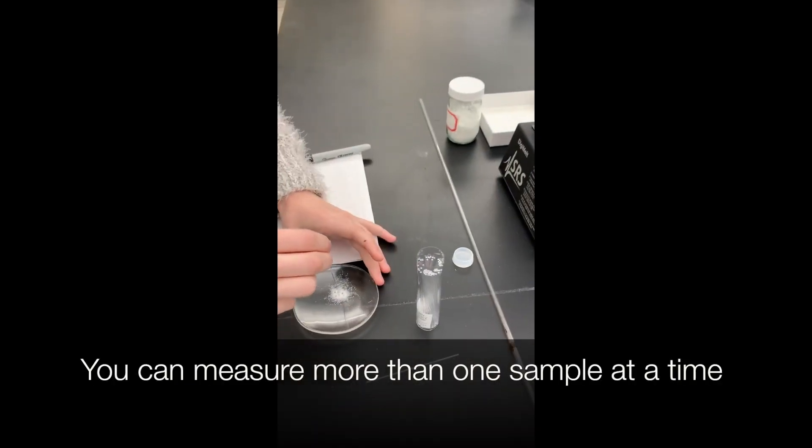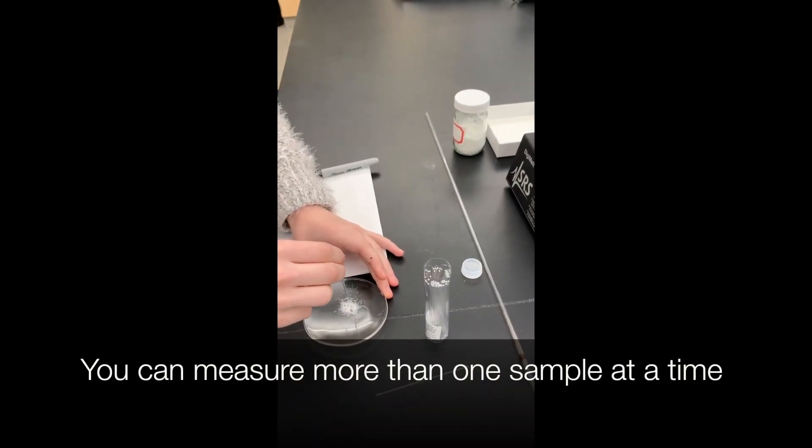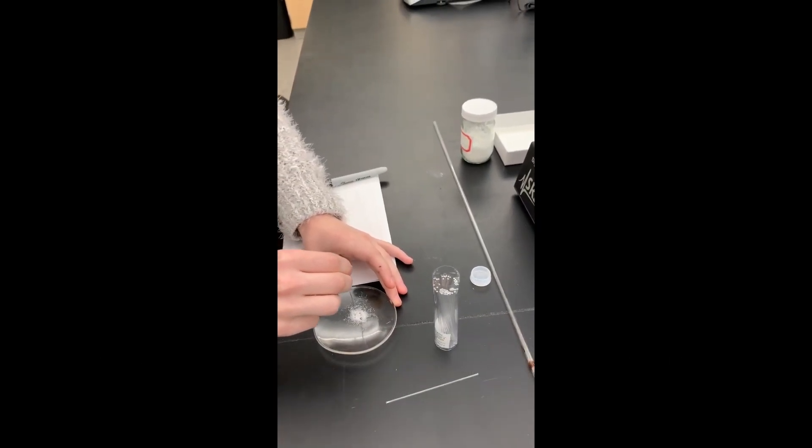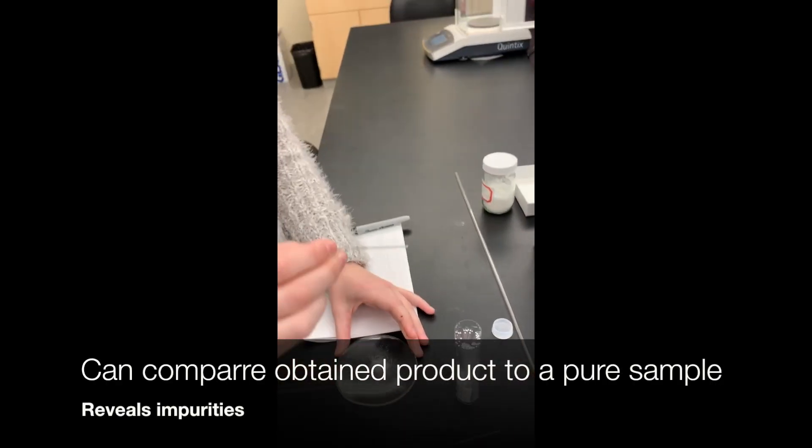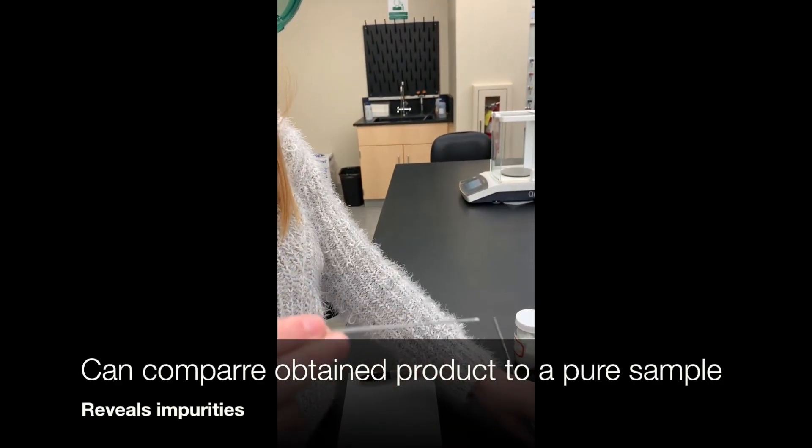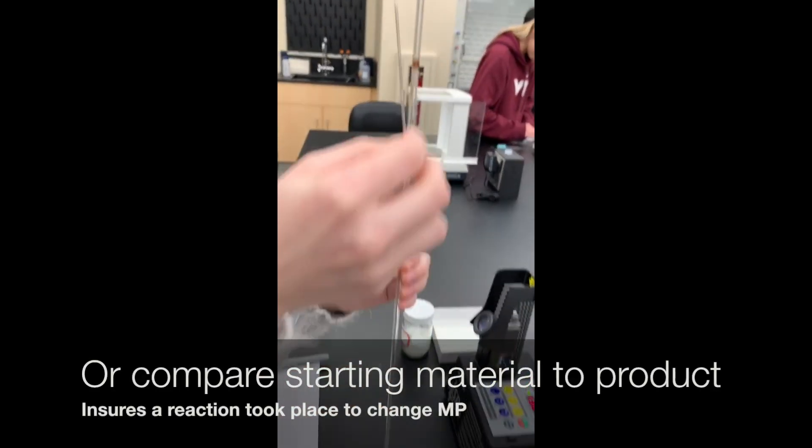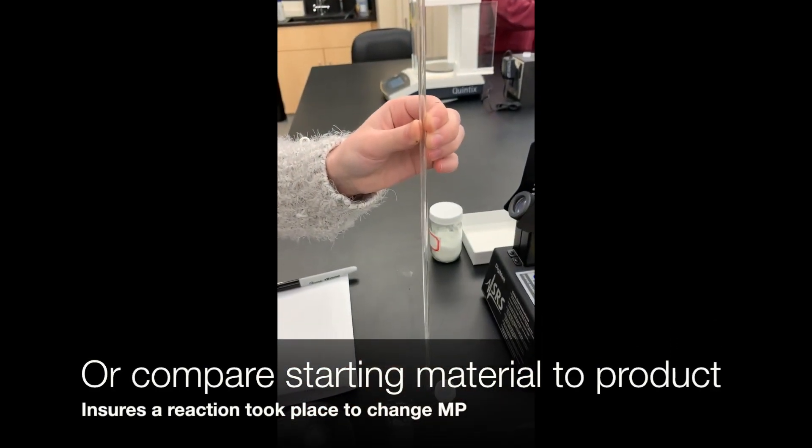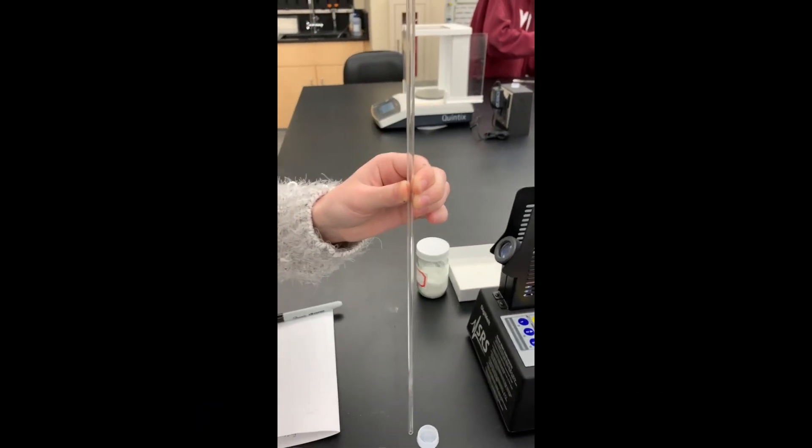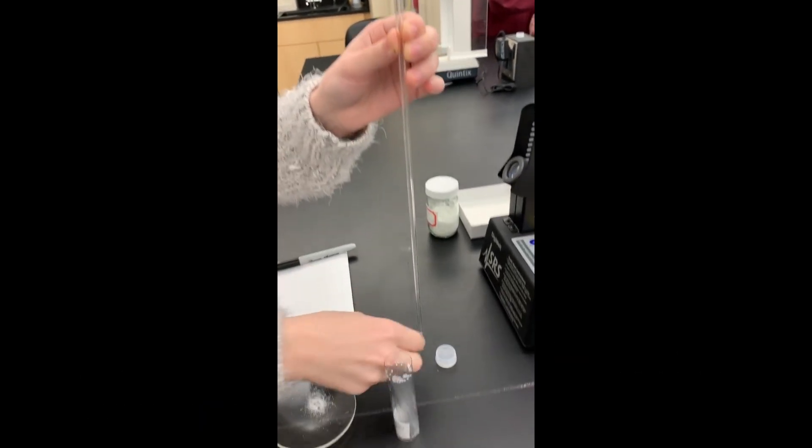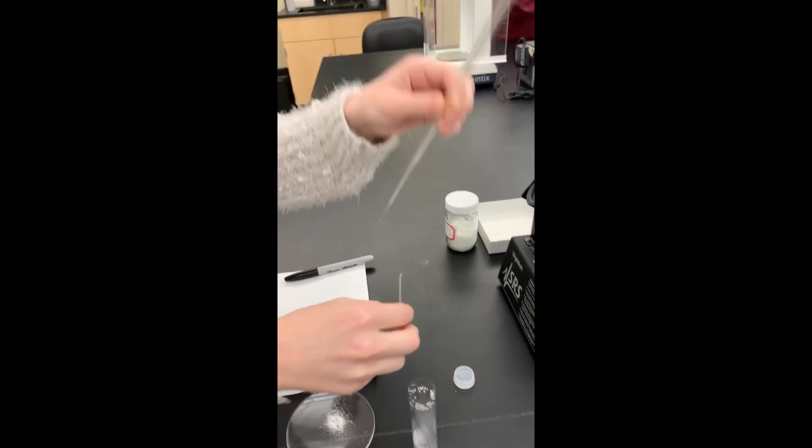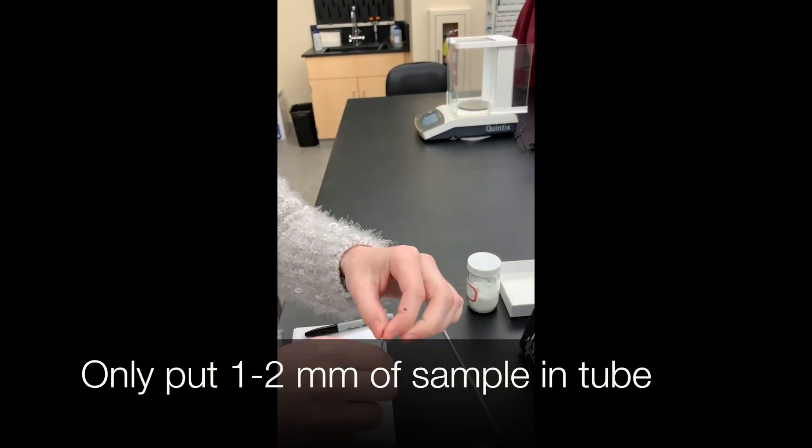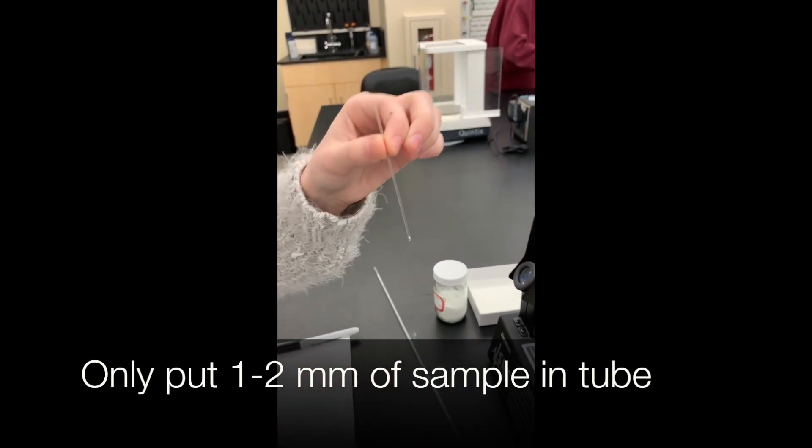You can prepare more than one sample at a time. You can use the melting point of two samples to compare the obtained product to a pure sample of the expected product to reveal impurities, or you can compare the product to the starting material to determine if the reaction actually took place. For example, you could compare the melting point of your aspirin product to salicylic acid, the starting material. The two melting points should be different.